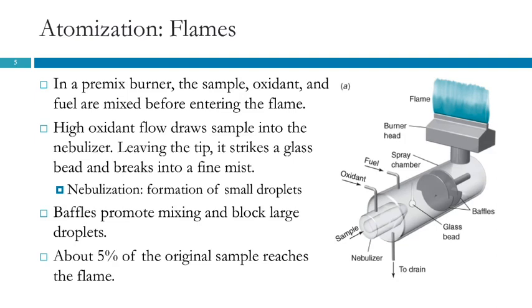What's important for our purposes is not that we understand the theory behind it, but just the general idea of how the instrument works. Okay. I was going to ask, the fuel and the oxidant don't mix with the analyte? It does. So the sample becomes a fine mist, and it mixes with the air. Our fuel is acetylene. It all mixes in that chamber and comes up here where it burns. So it's all mixed together.